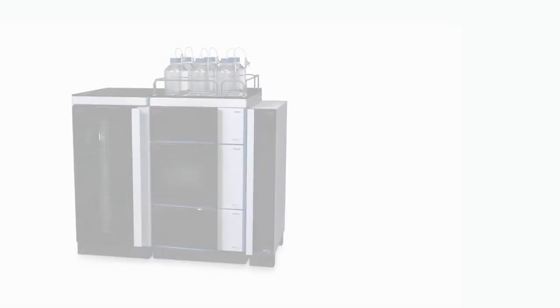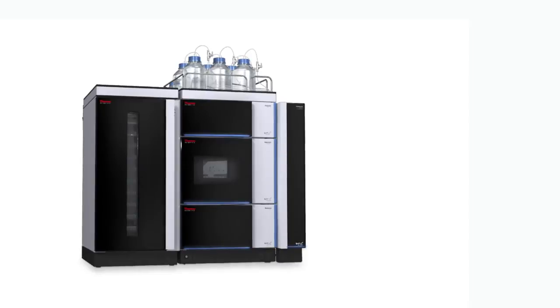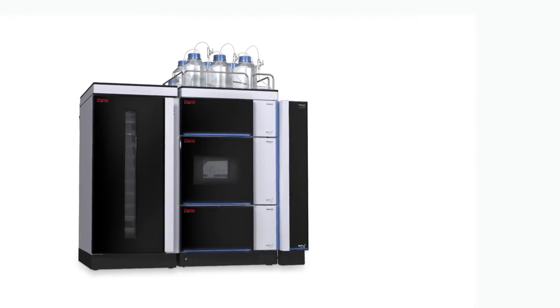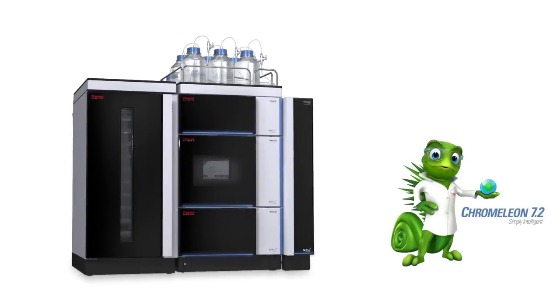The Vanquish system minimizes training time, even for novice chromatographers, with an optimized design and many automated features. It works perfectly with the operational simplicity of Chromelion CDS, making the Vanquish system a joy to work with.